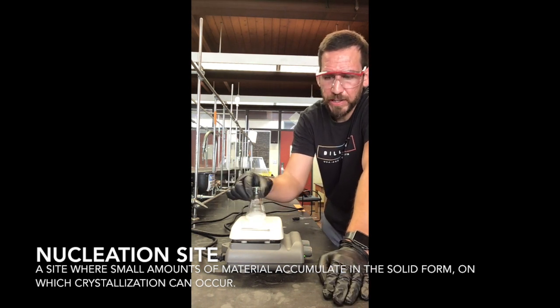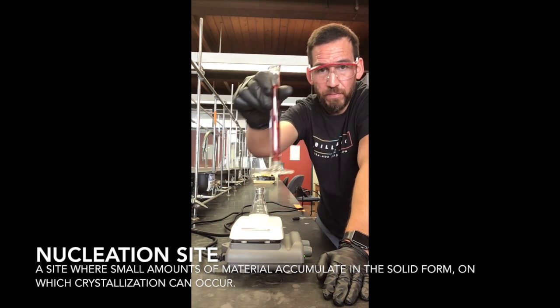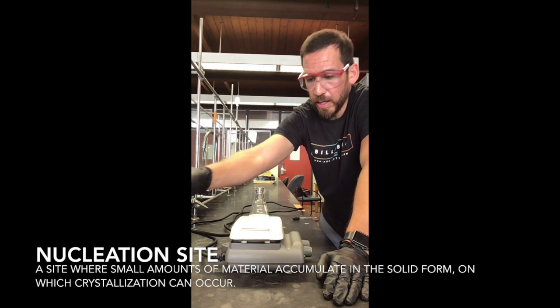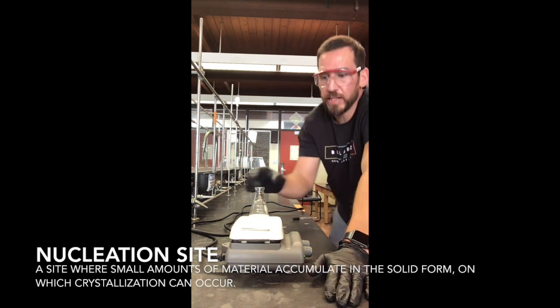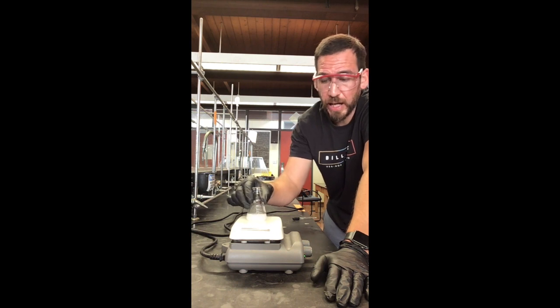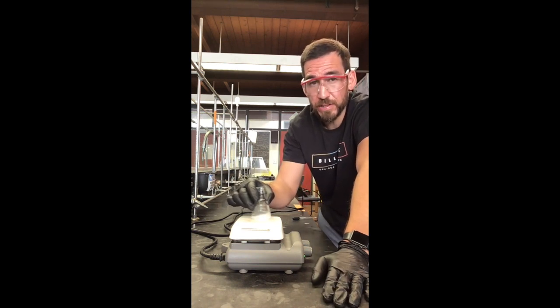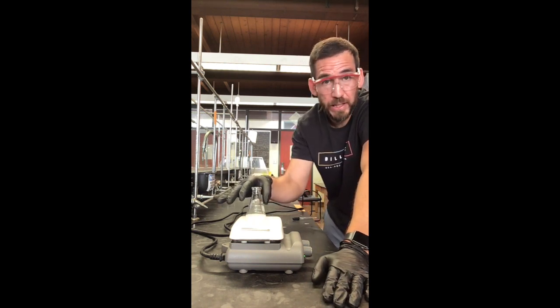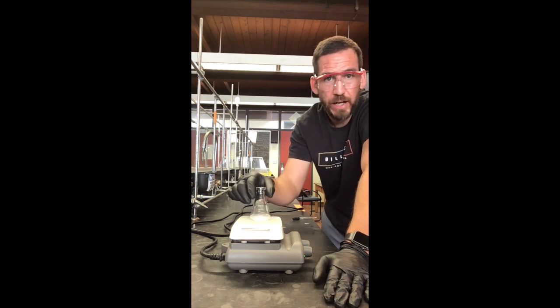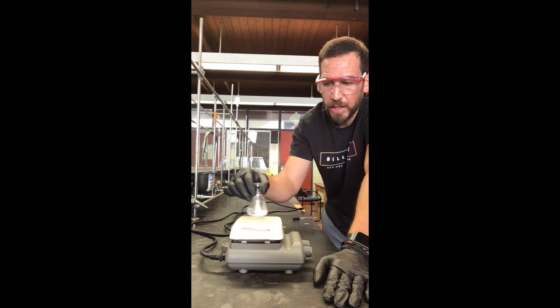So I find it very easy to just kind of stir it like this. Now I didn't add that full 15 milliliters because I wanted to make sure that I didn't add too much, okay? This was just an approximation that I made for myself. You want to add, again, the minimal amount of hot solvent to this. Once it starts boiling, then it's not going to get any hotter than that, right? This is ethanol, so it's like 85 or something like that. And that's going to be as hot as it can get.